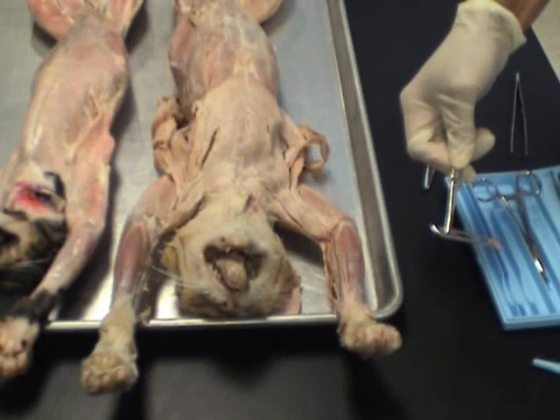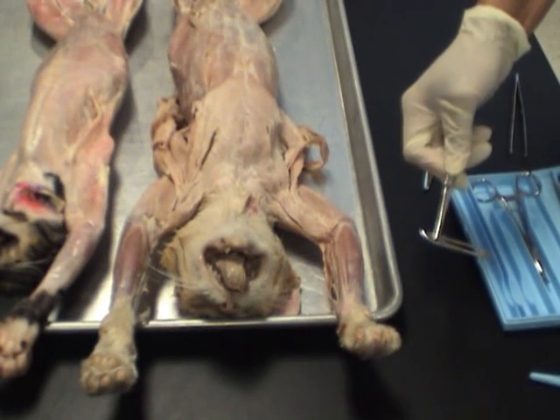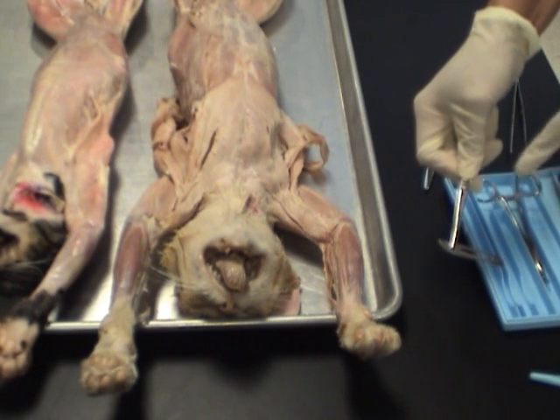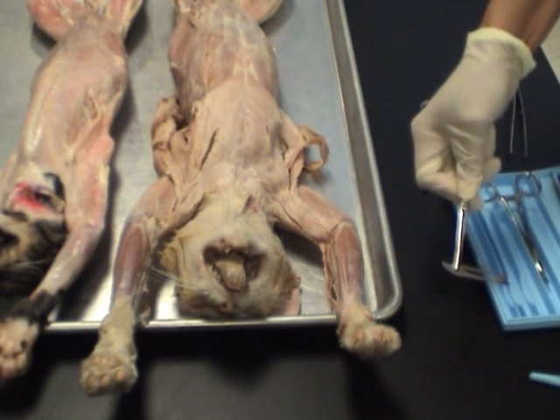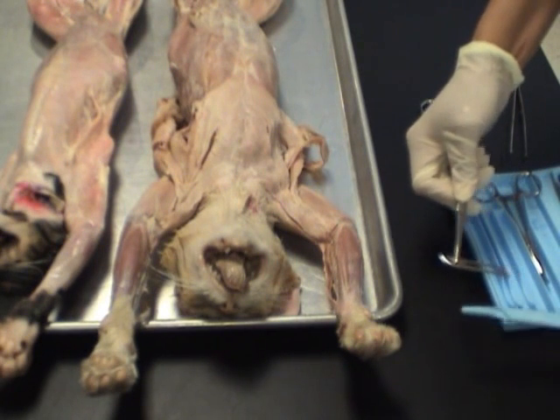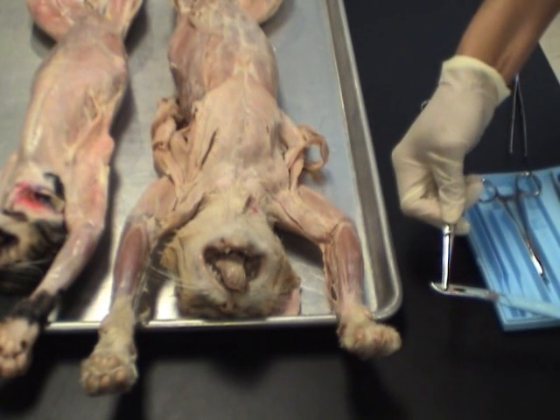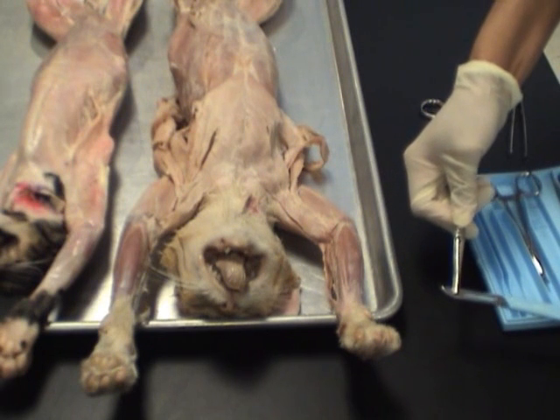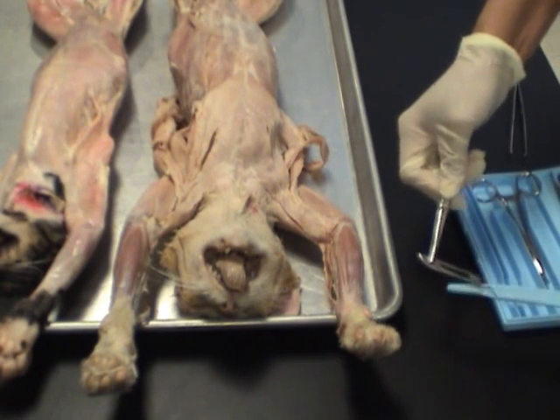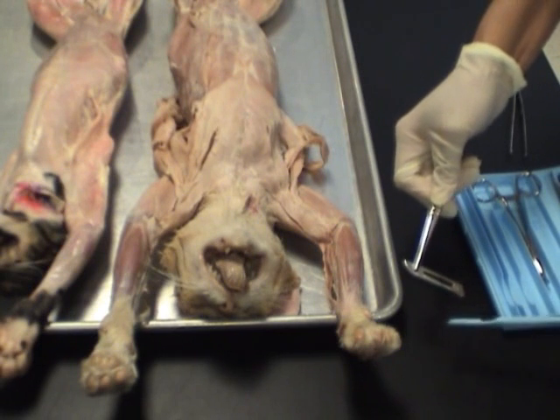Let's try to put the blade back onto the scalpel handle. Notice how I'm holding the blade. Make sure that the sharp edge is away from you, and always hold with the tweezers or the pickup. Then you hold up the handle of the scalpel, and we insert the blade so that it slides into this little oval area here, you can see.